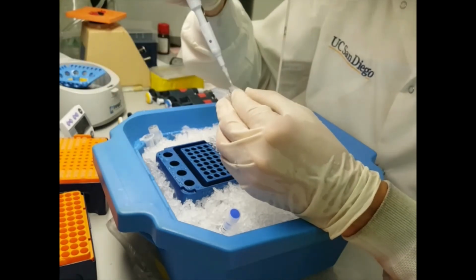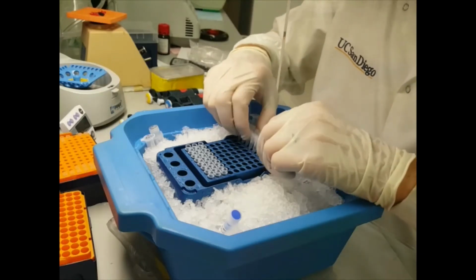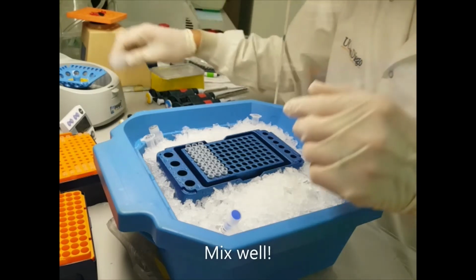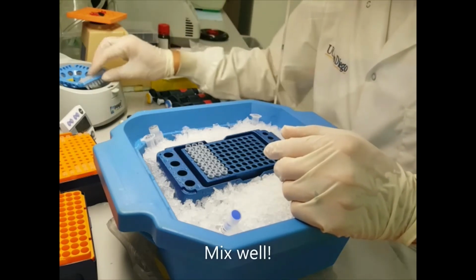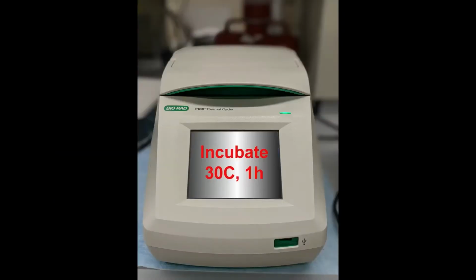Terminator, or its buddy XRN1, is a 5' monophosphate dependent exonuclease. Therefore, terminator readily degrades 5' monophosphorylated RNAs, including most ribosomal RNAs and microRNAs. To do so, mix the terminator master mix that's in the lid of the PCR strips with the small RNA. Spin down and incubate at 30 degrees for 1 hour.